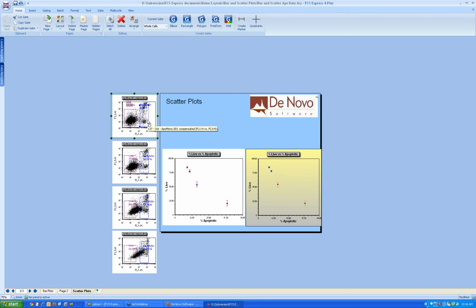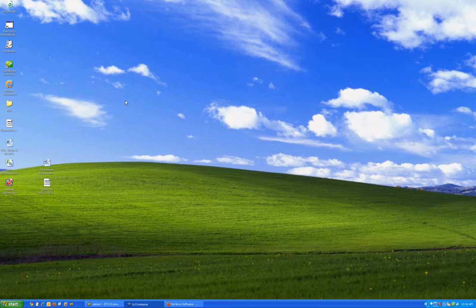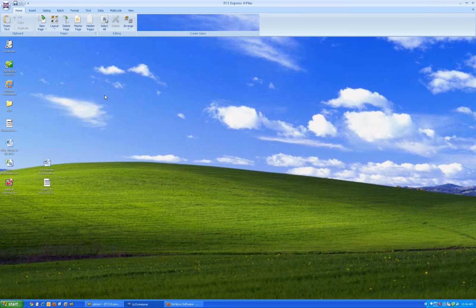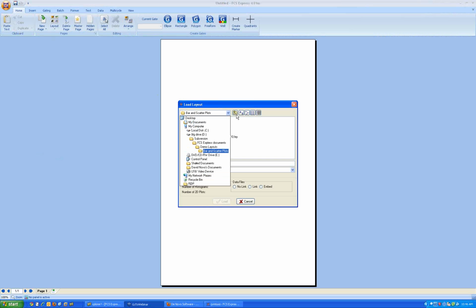Okay, a practical case for where this is used. I mean, it's used in many, many different ways. You can compare bar charts across samples and all sorts of stuff. But one thing that you can certainly do is, for instance, here is a titration experiment for CD64.